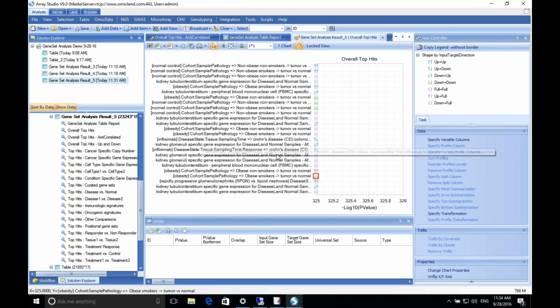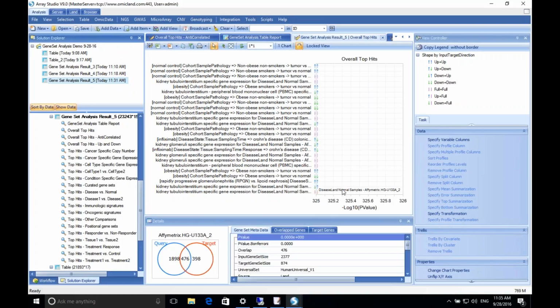But you can see it's hitting some areas that we haven't looked at yet, which is the tissue-specific gene expression and cell type-specific gene expression. So, for instance, you're seeing this one here is kidney-specific gene expression. It's hitting it from kidney. It makes sense because I took this list from a diabetes project where you were comparing obese versus non-obese.